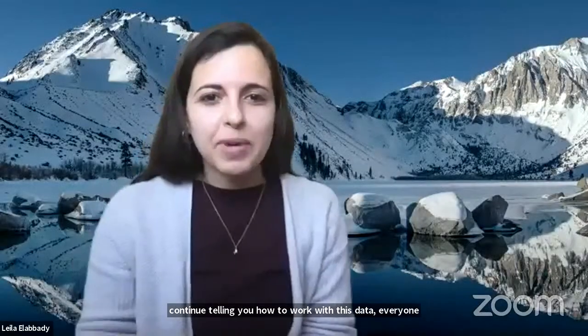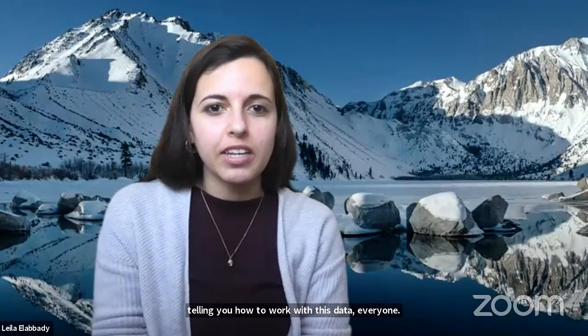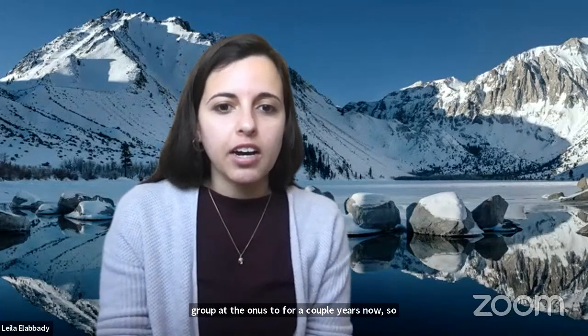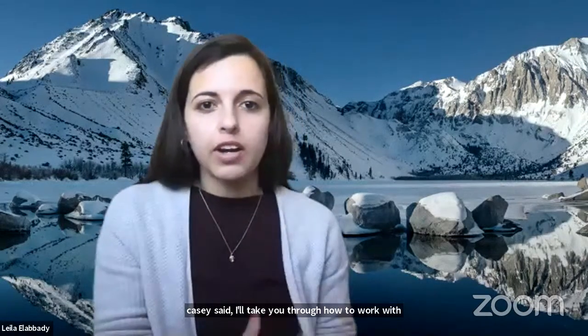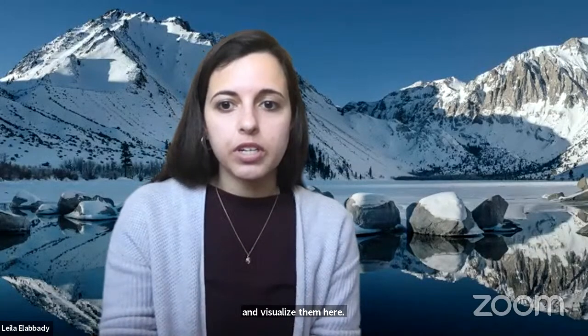Hi, everyone. I'm Layla. I'm a grad student at the University of Washington and have been working with the EM group at the Allen Institute for a couple of years now. Like Casey said, I'll take you through how to work with meshes programmatically and figure out how to analyze and visualize them yourself. So to do that, I will share my screen.